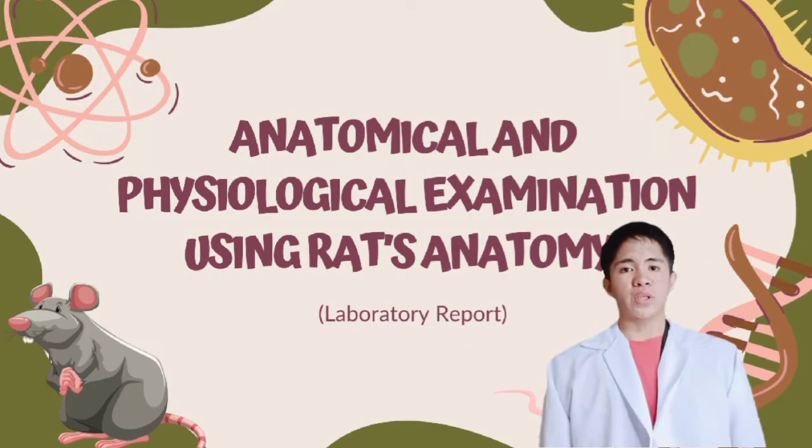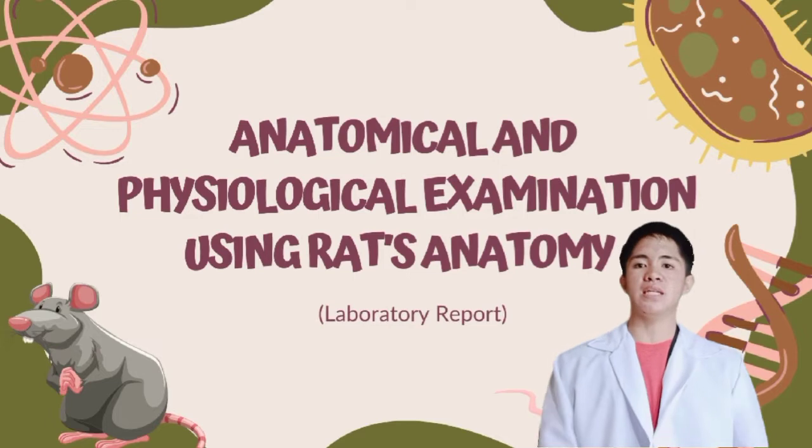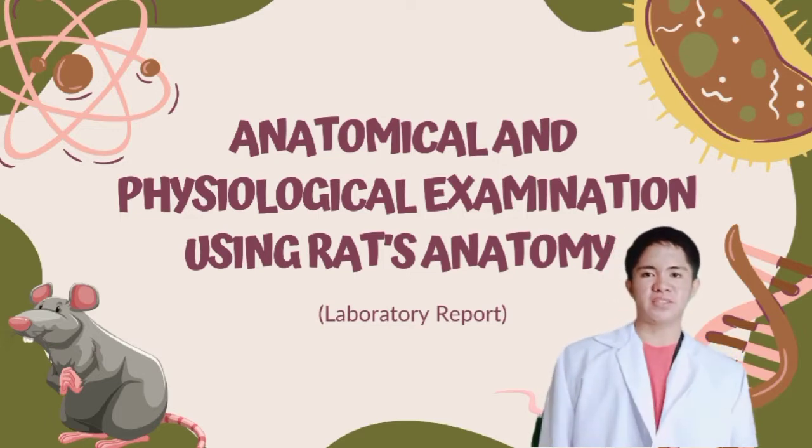Good day everyone! Today, we'll be discussing the anatomical and physiological examination using rat's anatomy, or rat dissection laboratory report. So, let's start.